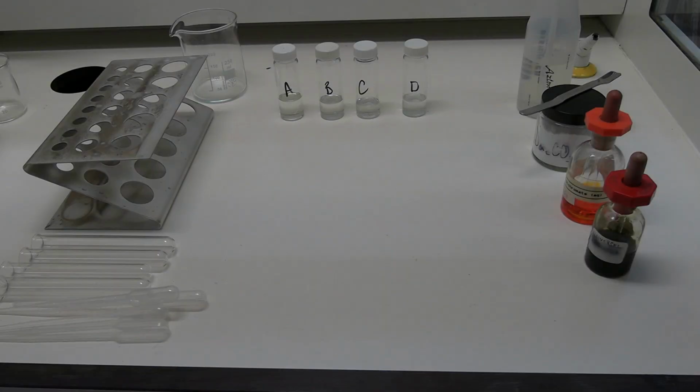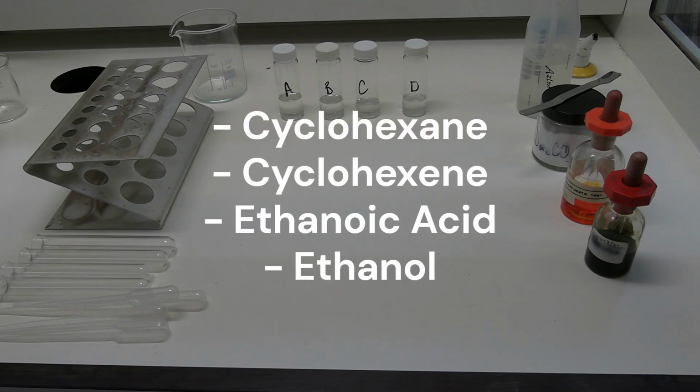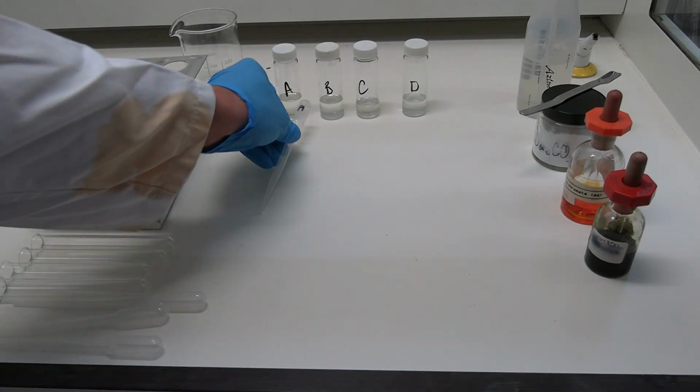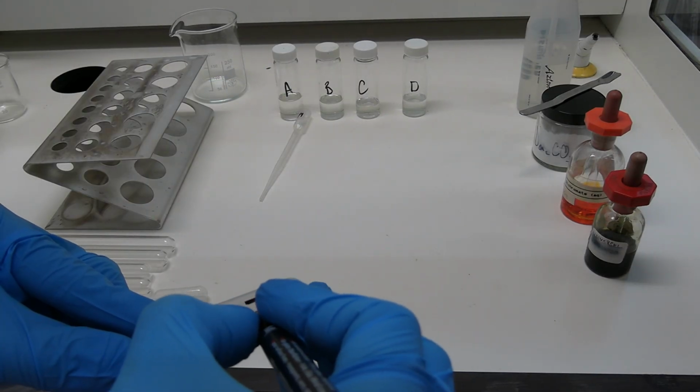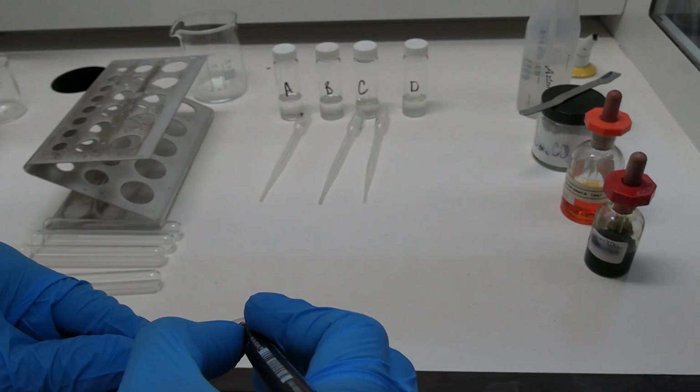Today we'll be testing 4 unknown chemicals to identify if they are an alkane, an alkene, a carboxylic acid, or an alcohol. These have been labeled randomly A to D and represent the following compounds: cyclohexane, cyclohexene, ethanoic acid, and ethanol. We'll start by collecting our equipment and samples, and to avoid cross-contamination, we'll also use the opportunity to label our pipettes.